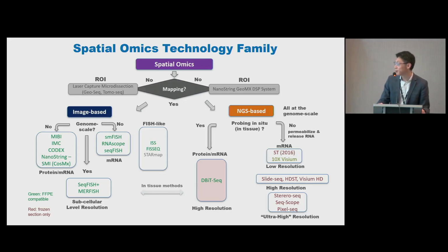About 10 years ago, our microscopy and imaging experts really pushed the boundary by developing extremely high-plex protein imaging or FISH, two different technologies, including high-throughput FISH. Eventually, they were able to even demonstrate whole genome-wide or transcriptome-wide gene expression imaging using single molecule FISH. And for protein spatial analysis, there are several different approaches.